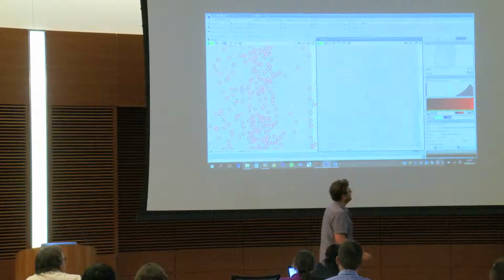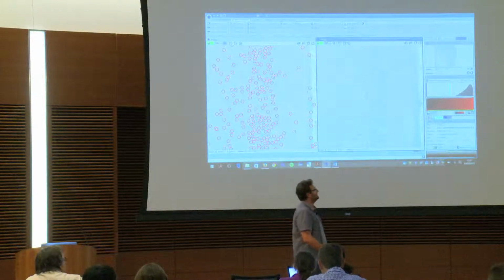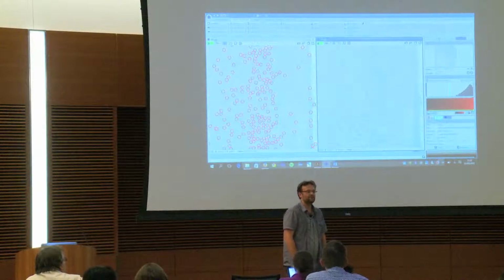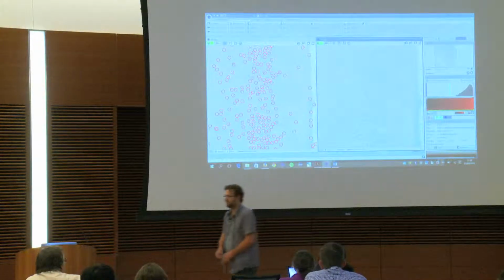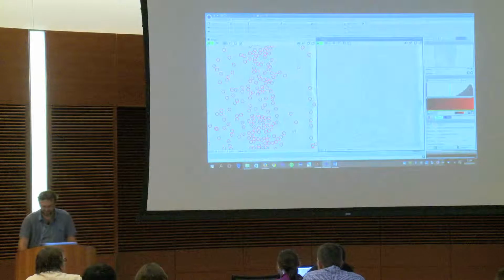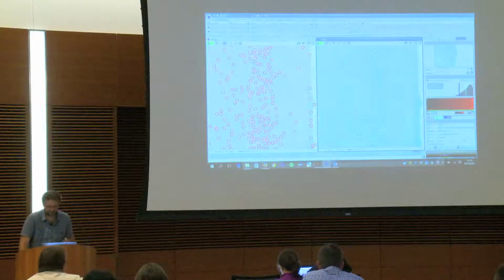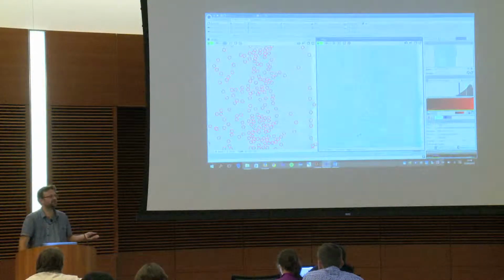Okay, so you're absolutely right, because the first thing is that thanks to the histogram, you see something obvious, that the image is not captured well. It has been saturated. So if you do this, because you want to go back to the proper dynamic, you see that the color is changing.